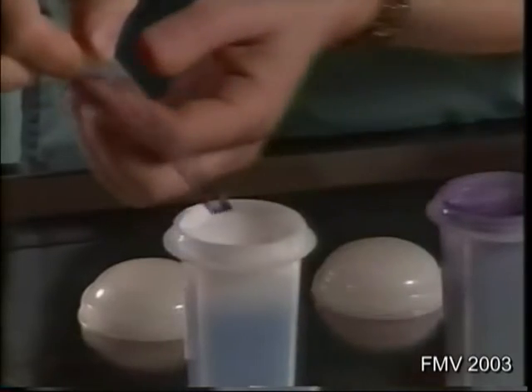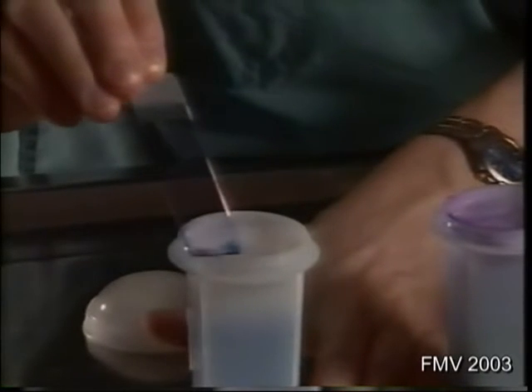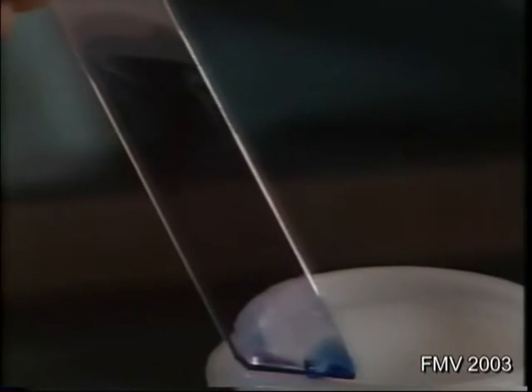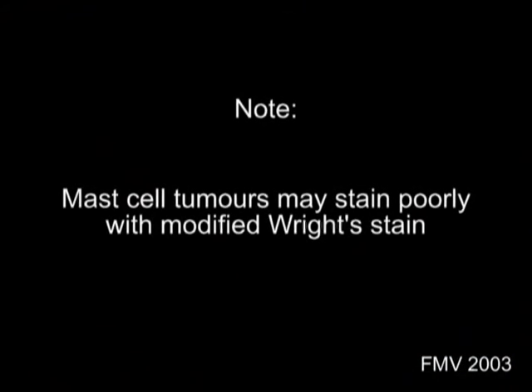Note that it is not necessary to fix your slides with a fixative solution or spray prior to staining. The air-dried slides may be sent unstained to an external laboratory if you're not going to review the slides yourself. The modified Wright stain that is commonly used may not stain certain mast cell tumors very well, making a diagnosis difficult. For these tumors, a Wright's or Wright-Giemsa stain is recommended.